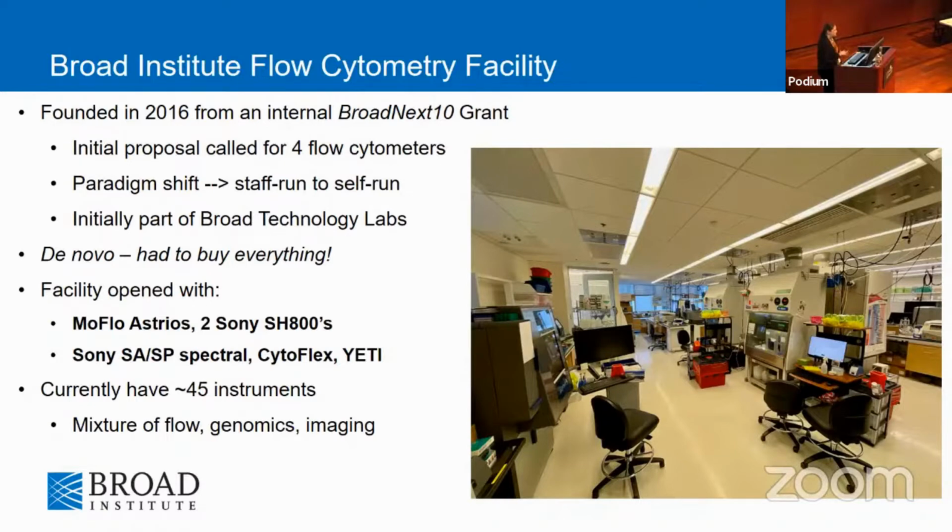So I had to think about how to set up a facility from scratch to really serve the research community there. The one thing I came up with was making it truly a self-run facility. I gave the reins basically to the researchers so they could run anytime they needed, so they didn't lose those precious samples.